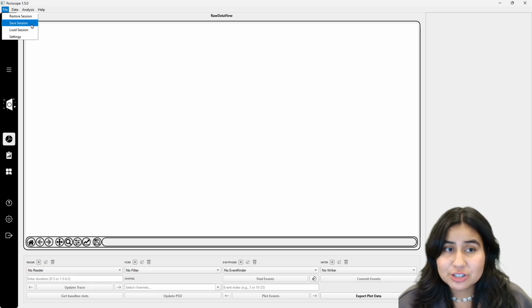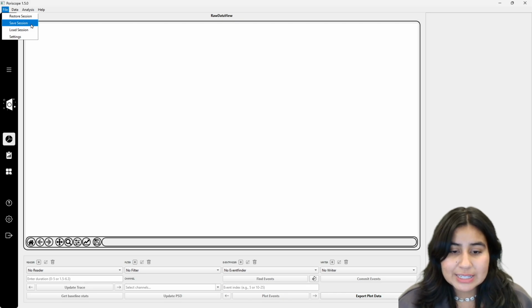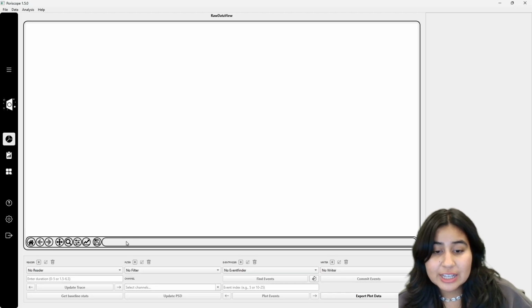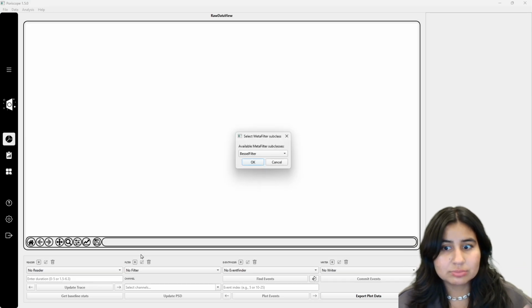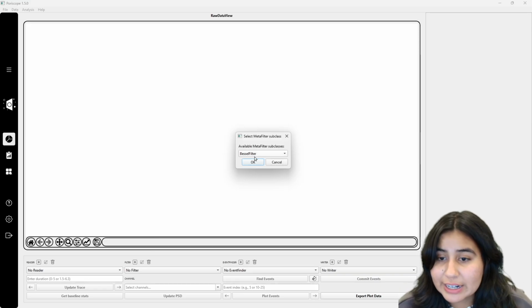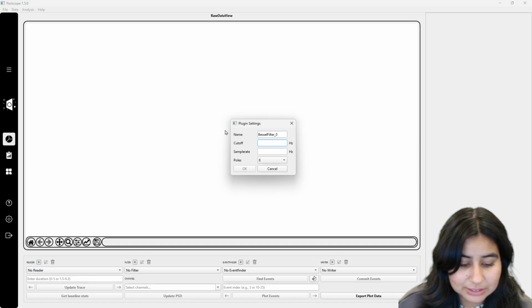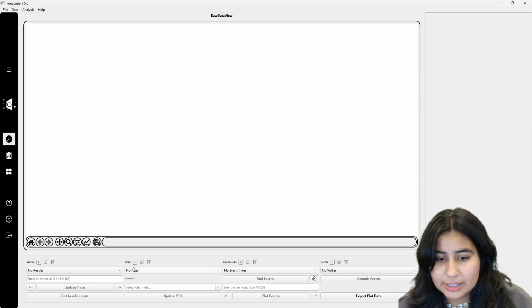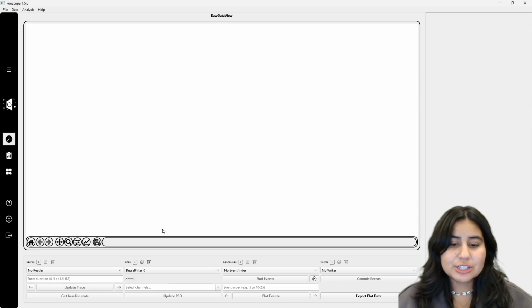Save Session is the first one you can use. So basically, once you have conducted an analysis pipeline, you would have added readers, filters, event finders, writers. If we want to keep it simple now, don't care about the details yet. We will look at the actual analysis in part 2, but if we added a filter, for instance, then we create a filter, we have it there, that's our session.